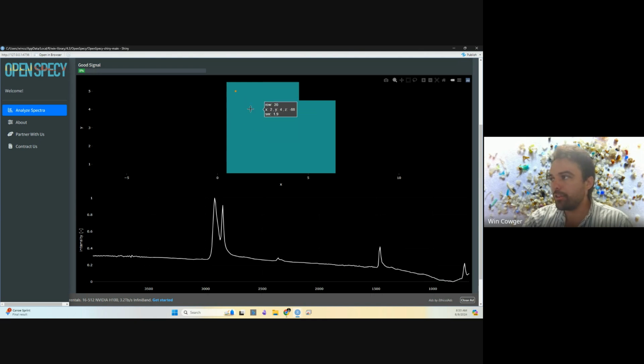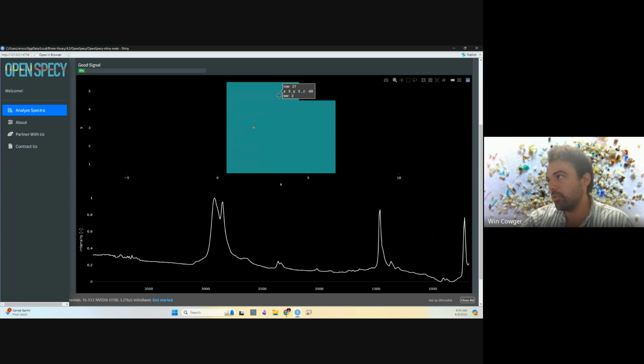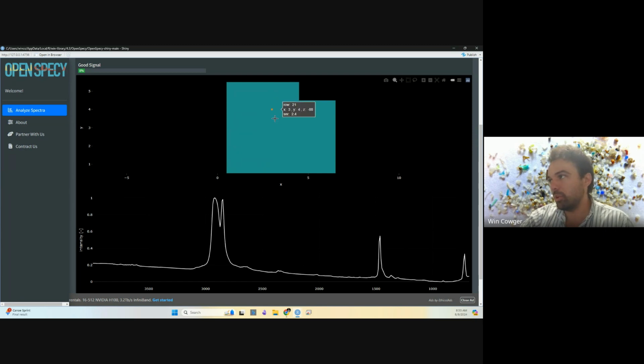One thing you'll notice is that all of the squares just turn blue. And when that happens, it means that all of the values are below your threshold. So if they're all one color, then everything's too high noise, basically, right now is what we're looking at. So everything's much less than 4.